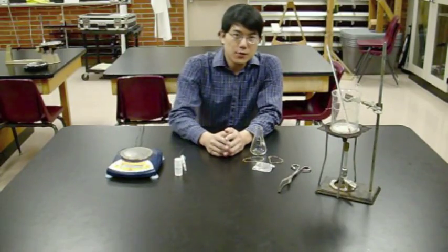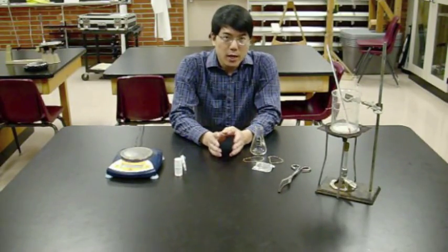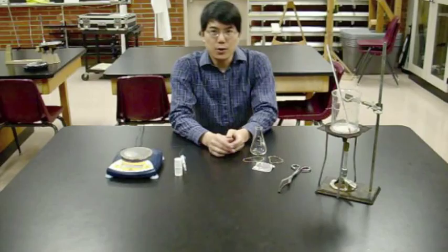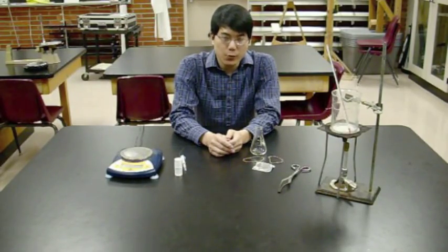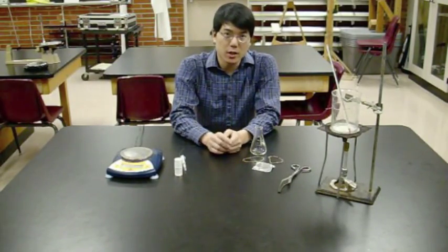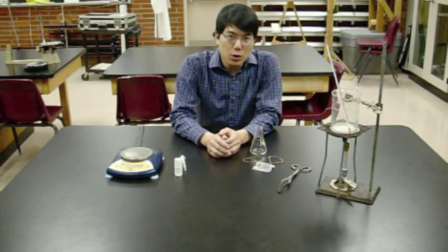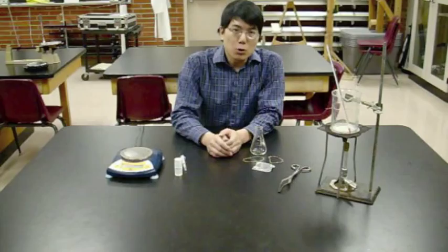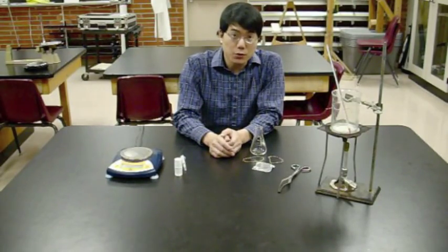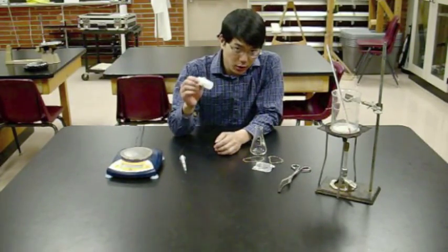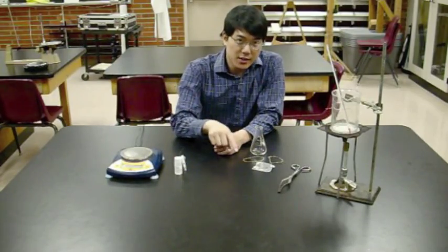This video gives you an overview of the lab and detailed procedures for part one. The overall goal is to measure the molar mass of your unknown vapor. It starts out as a liquid that you're going to turn into a gas and then measure its mass.